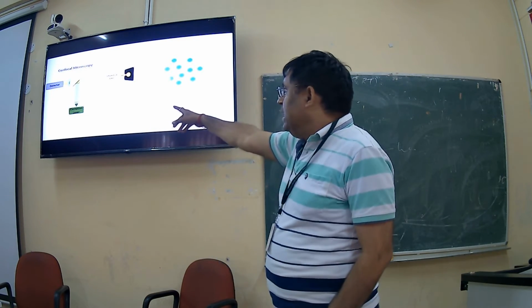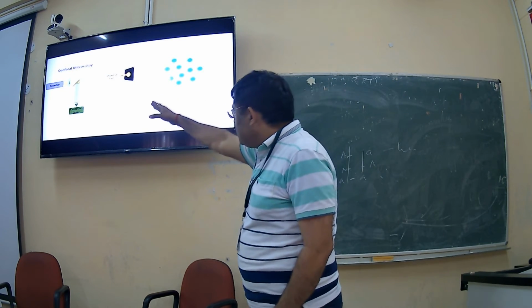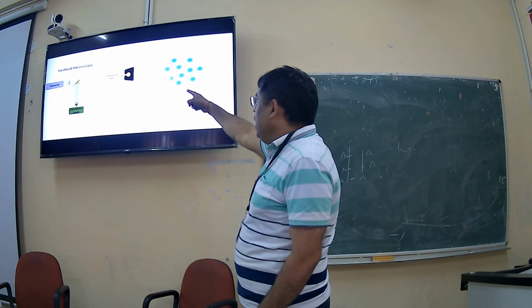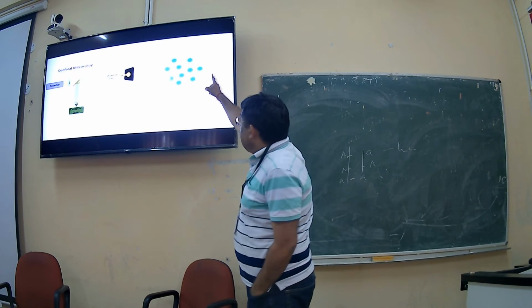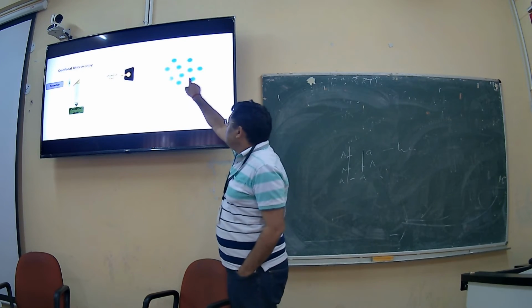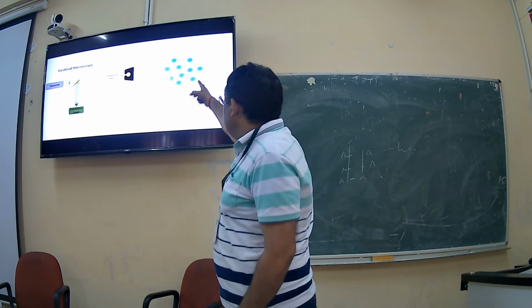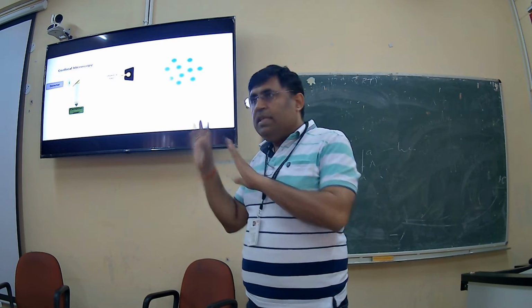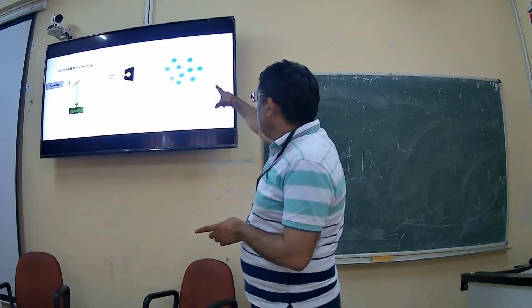There is an excitation laser which falls on something going through the objective lens, and it is falling on some specimen. Let's say this is some area of your specimen where there are a few molecules. Let's say these are the fluorophores. When excitation comes, these fluorophores will emit energy. Is this clear to you? Because they are fluorescent, when excitation goes, they will fluoresce.